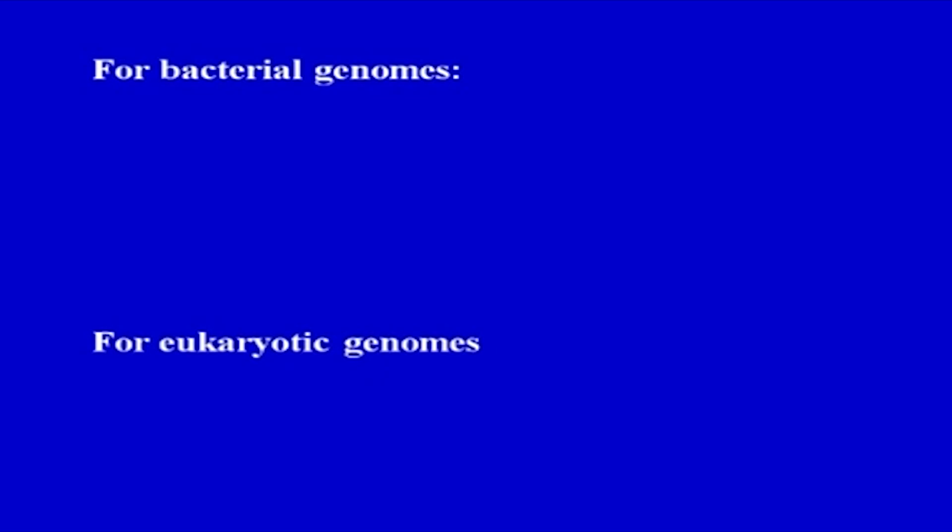For eukaryotic genomes, there are much greater sizes and they require this shotgun strategy to be carried out in stages. So, here a bacterial artificial chromosome library of say 150 kilobase inserts is generated. The insert in each of these artificial chromosome clones is identified by sequencing 500 base pairs in from each end to yield segments known as sequence tagged connectors or BAC ends actually.